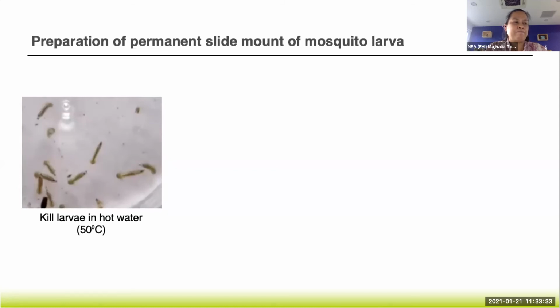Formalin, I haven't tried it, but I don't think it's recommended for these very small samples. Because if I remember right, 10% formalin will cause your sample to be brittle, and then you can no longer mount it. If you want to mount your sample, better to use ethanol for storage, because once you put it in formalin, it will be very, very rigid and brittle.